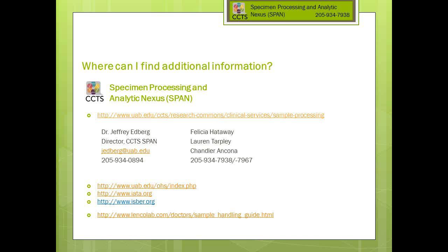I don't think we've done much with CSF for research studies, but certainly we have that capability. Saliva, we have worked a little bit with saliva for DNA extraction, and we've done some buccal swabs too. In one study, when you do a buccal swab, you really have to scrub hard. They were very gentle in that study, and we got very little DNA. We just didn't do it right. So again, it all goes back to sample collection. But certainly we can help advise on that. We've not done a lot of it, but we have done some. And I think it's Genotek, the company that has DNA collection kits for saliva.